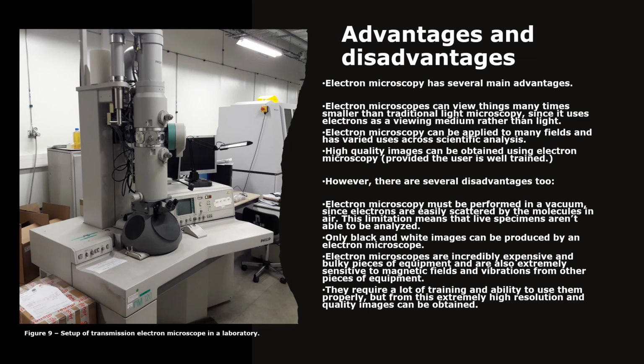This obviously means that a lot of time and resources are used in the training of people to use the electron microscopes. In summary, the main disadvantages are cost and space related, but training to use the apparatus is extremely important to consider as well.